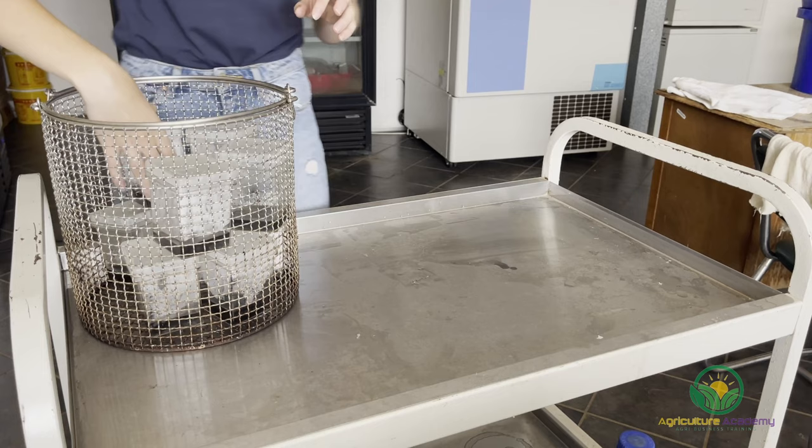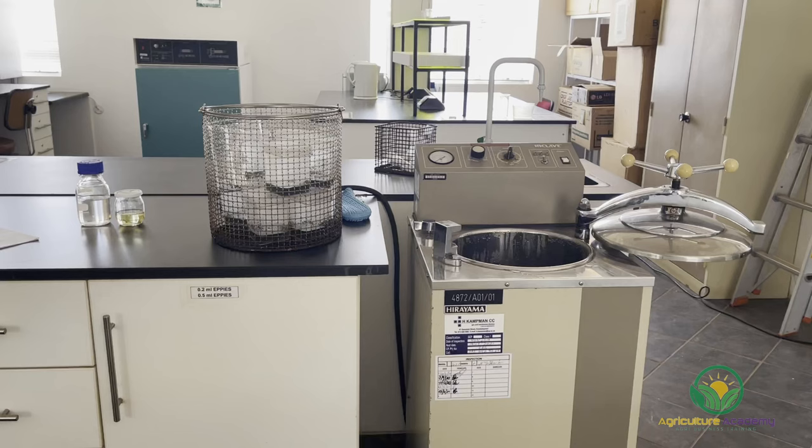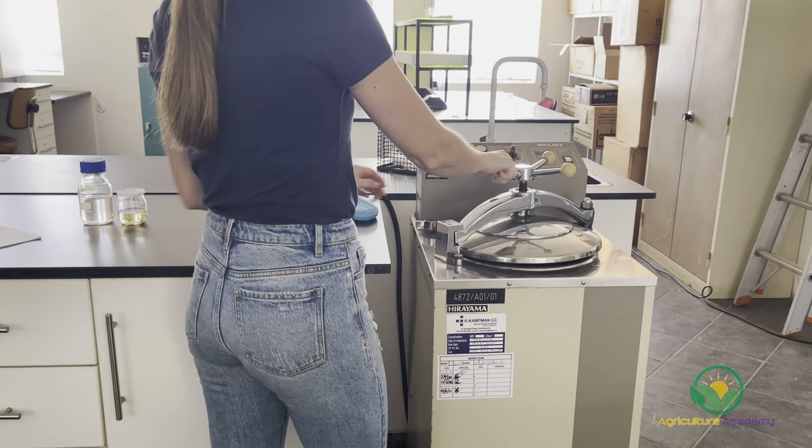Other equipment like scalpels, tweezers, jars of distilled water, and jars of bleach were also placed into the autoclave baskets. If you need to sterilize your medium at home, pressure cookers can be a viable option. Just make sure you use the old-fashioned, manual cookers and not the modern computerized versions. These newer pressure cookers do not reach the temperature and pressure required to kill all the pesky spores and pathogens in your media and on your equipment.